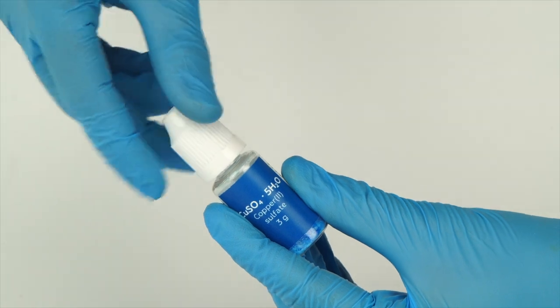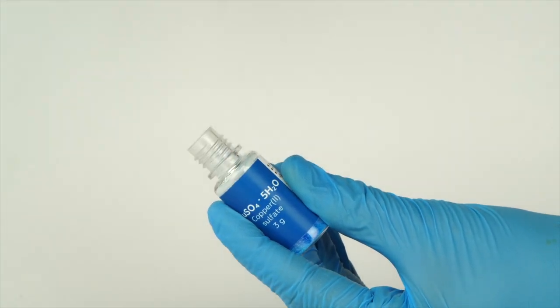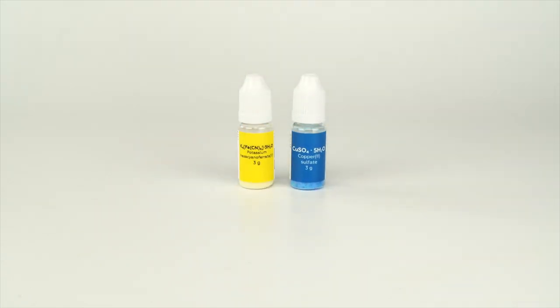To open a bottle containing a reagent, push the cap down and turn it. For the chemical reef experiment, you will need copper sulfate and potassium hexacyanopherate 2.